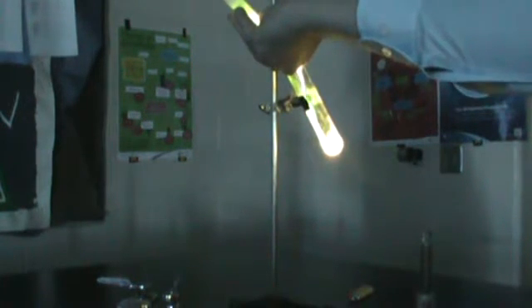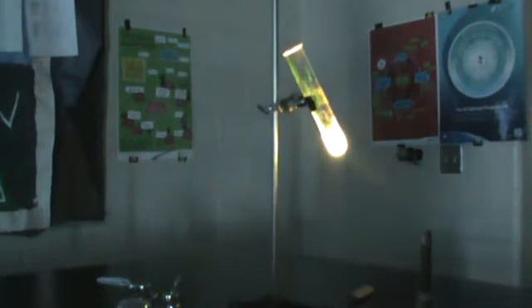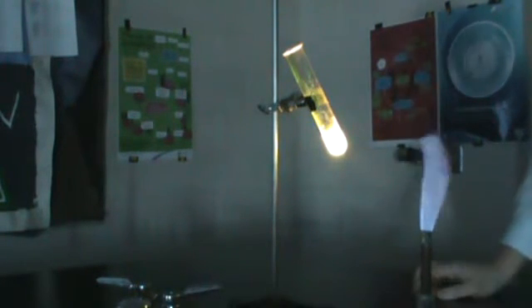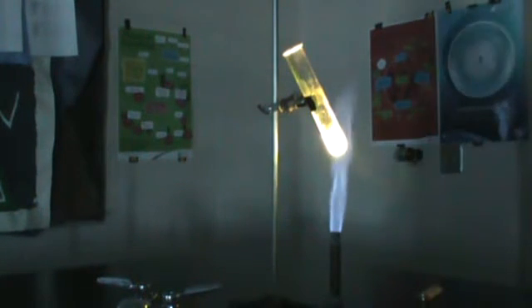So let's pour this in. Looks like I actually saved the glass. Now I'm going to light this Bunsen burner and I'm going to heat up the dye. If you look at this right now and then right after I put this underneath, the change in light is really, really brilliant.